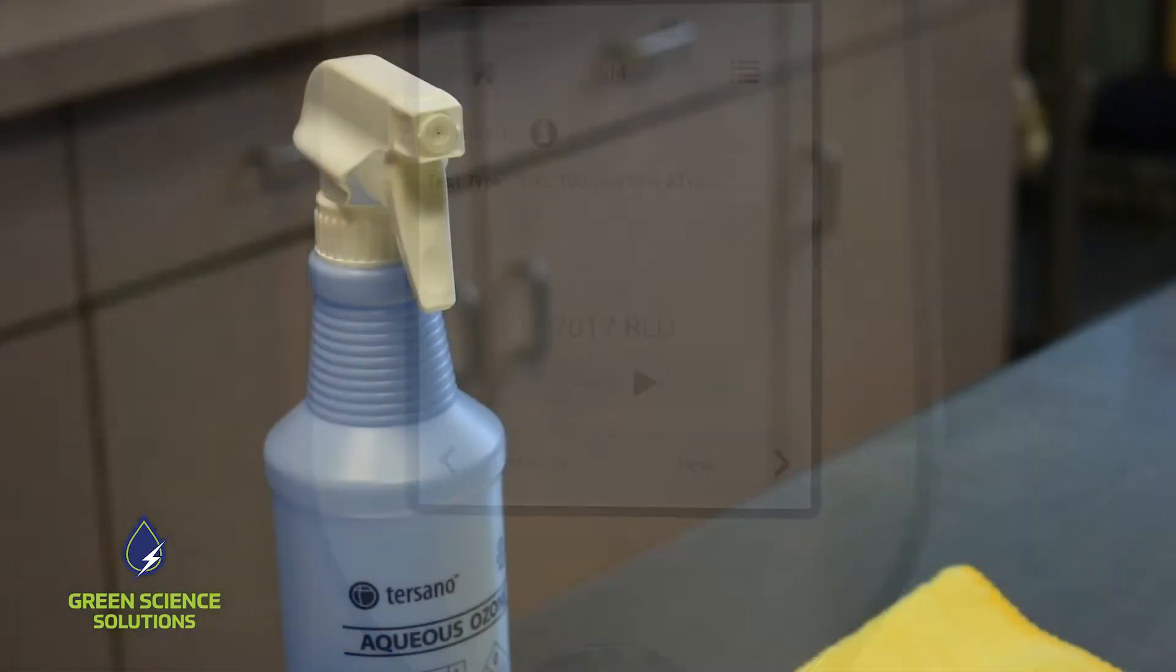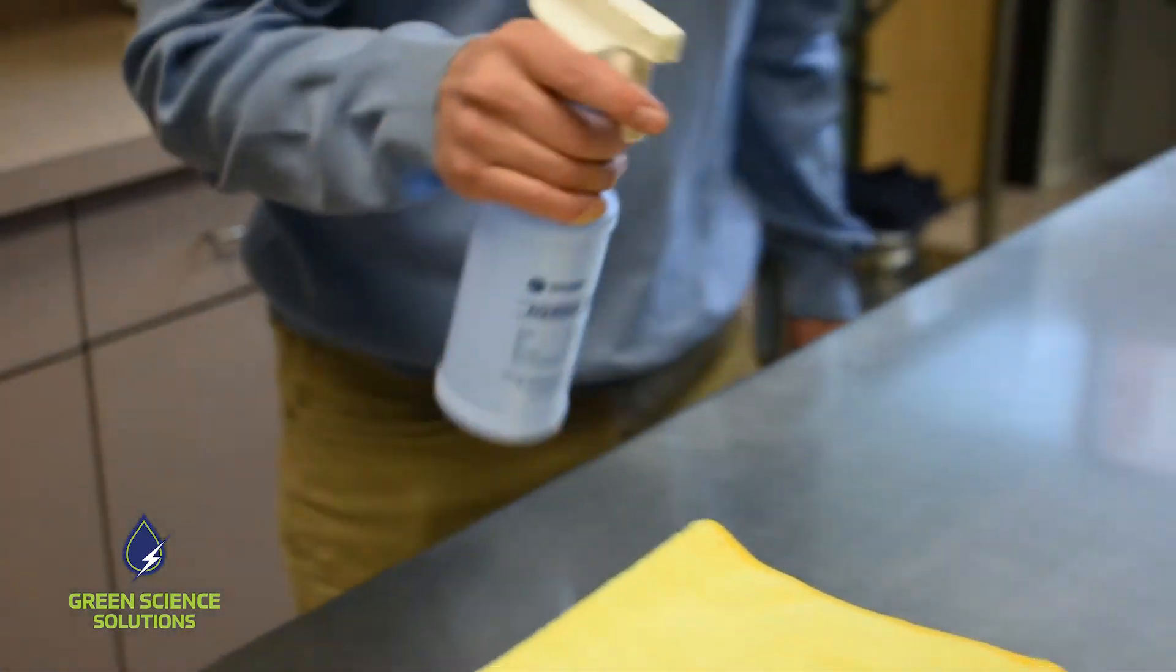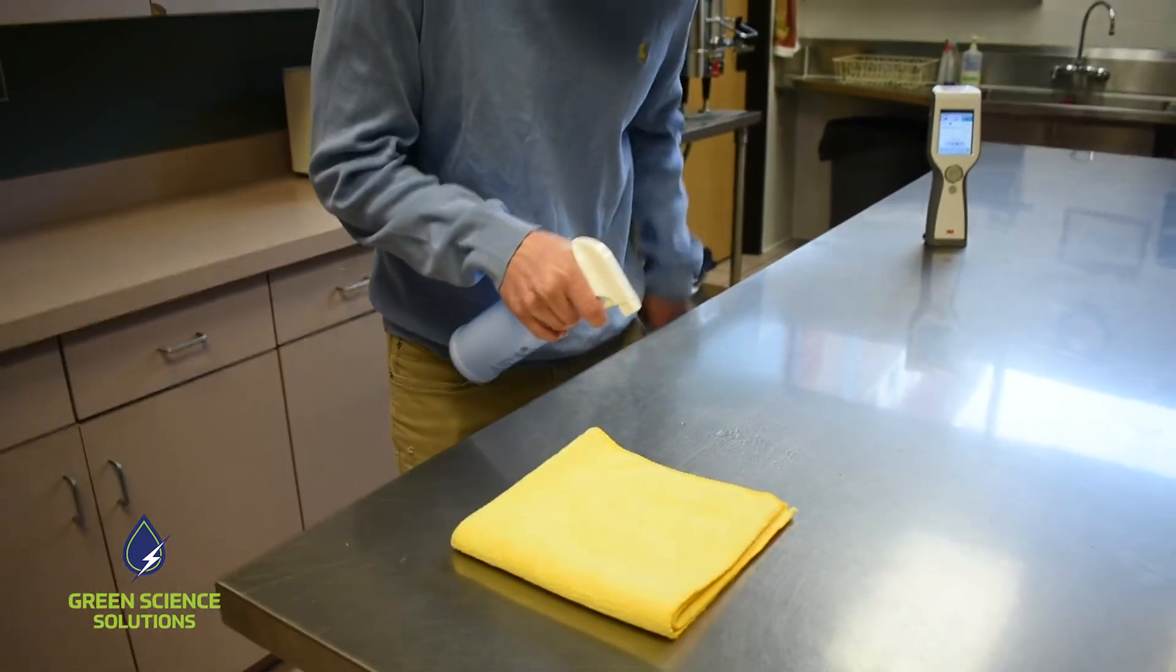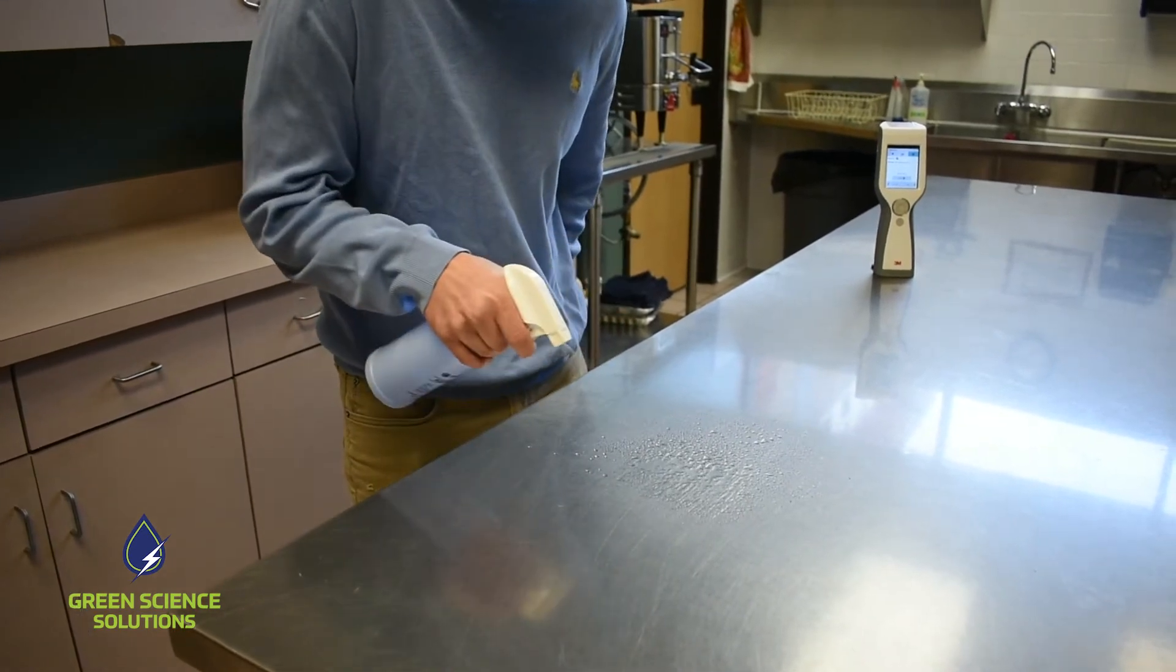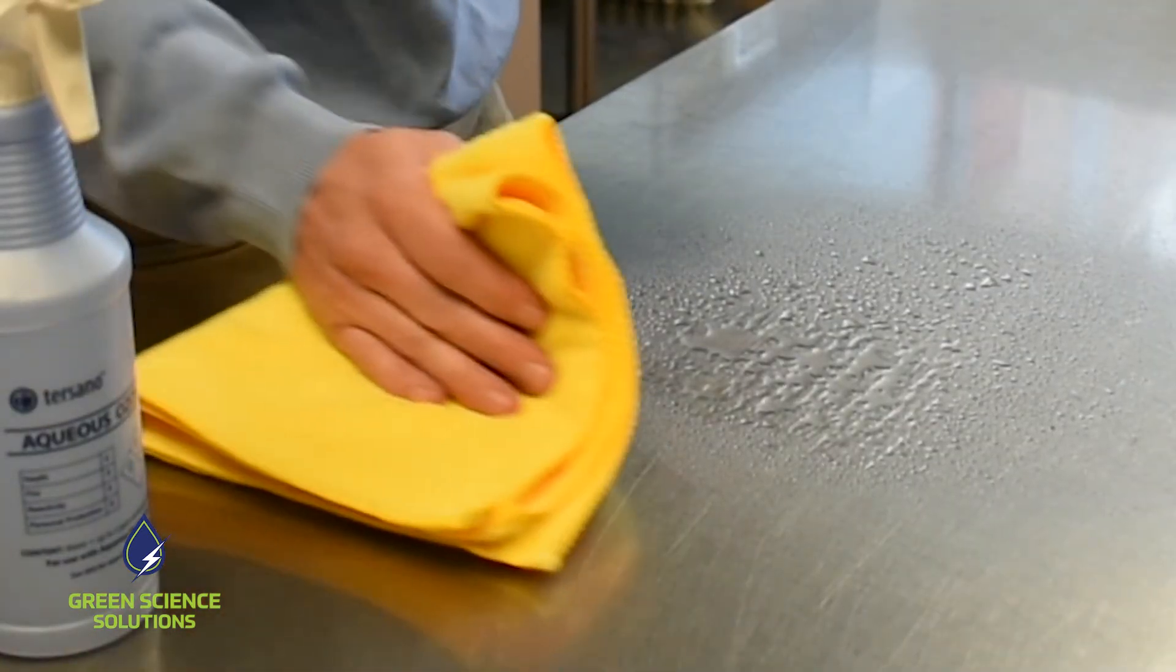Remember that number, because now we're going to repeat the process using SAO. First, we clean the area we just swabbed by spraying it with SAO. After we wait for one minute, we dry the area.